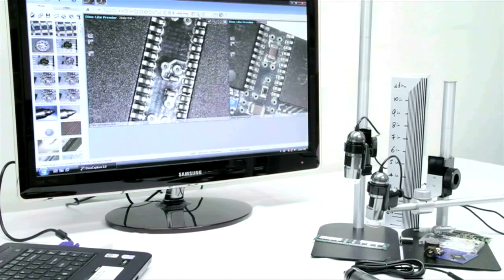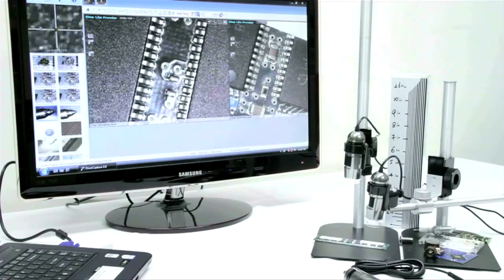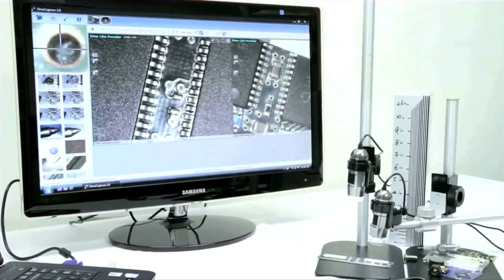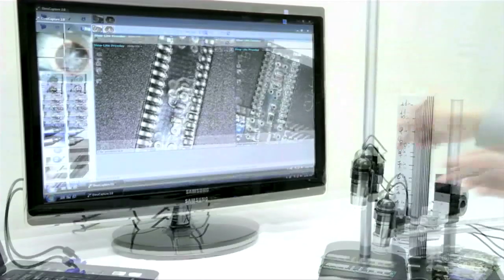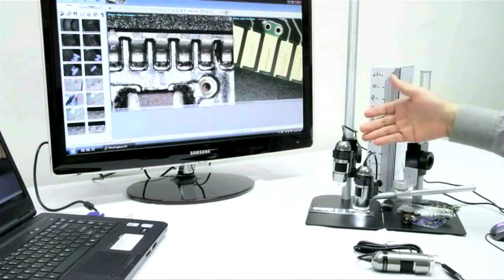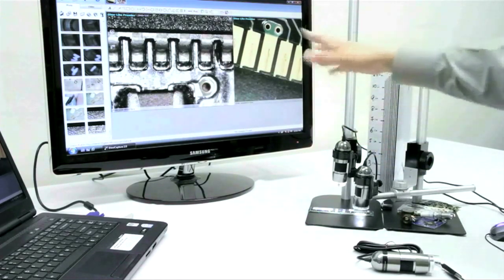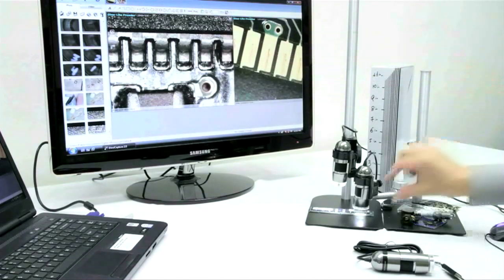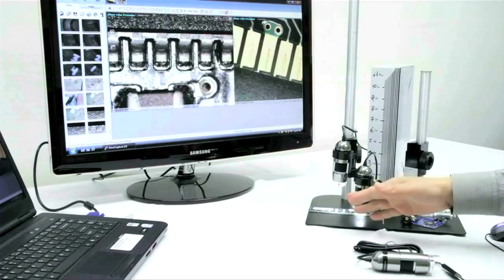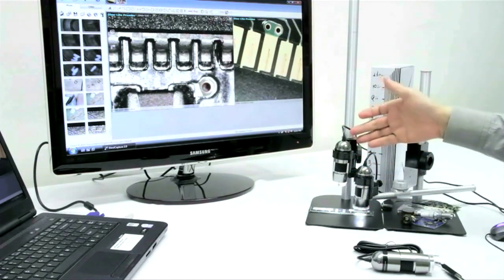Once we get the image in view, we can fine-tune the focus by using the fine-tune knob on the MS-35B stand that we are using here. As you will notice on the screen, both of these images are in focus and both of these microscopes are set at 80 times magnification. You will notice that the longer working distance model, the L series, is a little bit further away. So if you do need space and are needing to have a high magnification, the L series is suggested.